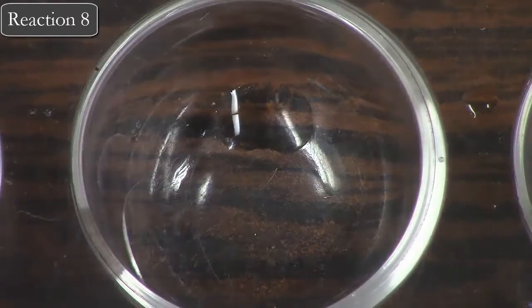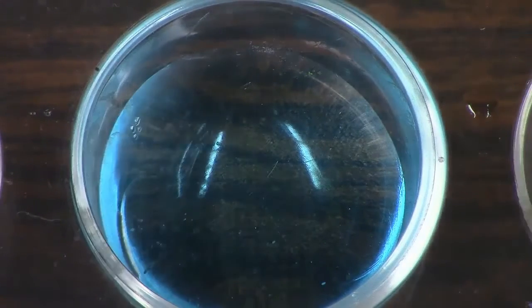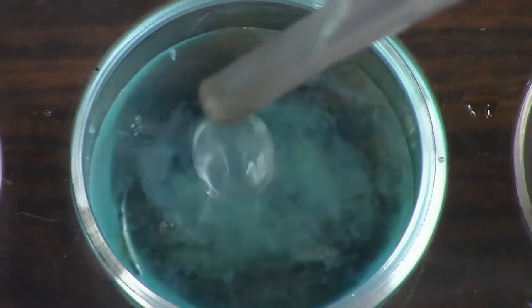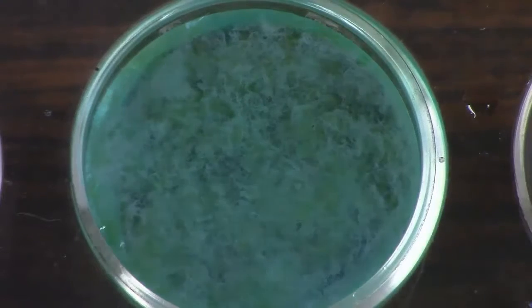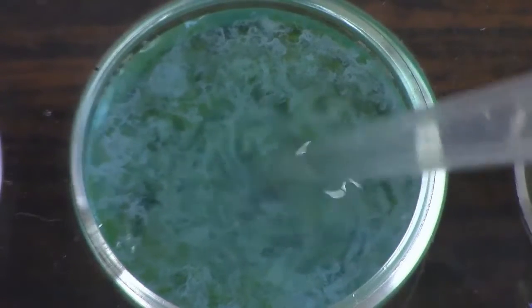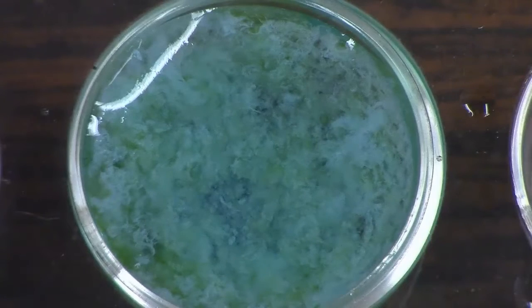All right, in reaction number 8, third to last one, we're going to use a pipette once again and add a few drops of copper(II) nitrate solution to a free spot on the well plate. The copper(II) nitrate is that classic blue color. Now to that same spot, we'll use a different pipette and we're going to add a few drops of sodium phosphate solution. All right, this is a pretty cool reaction. So the sodium phosphate was added. Record some observations about what happened when those two solutions were mixed, and use those observations to predict what products might have been formed. Now, you probably can predict what has been formed based on the change we've just observed.